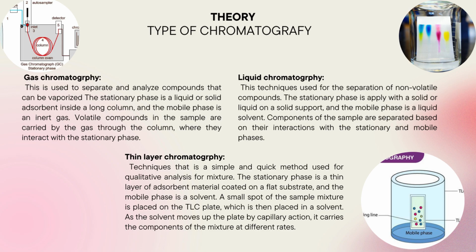Second, liquid chromatography. A technique used for separation of non-volatile components. The stationary phase is a solid, or a liquid on a solid support. Meanwhile, the mobile phase is a liquid solvent. Components of the sample are separated based on their interaction with the stationary and mobile phases.